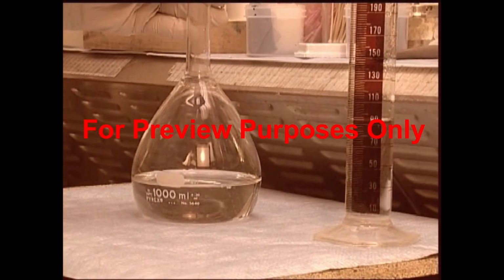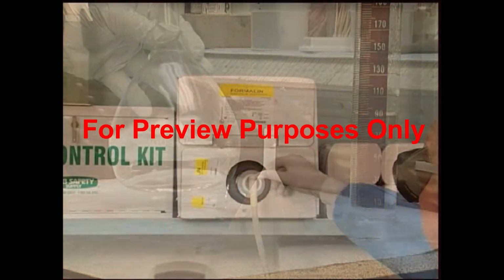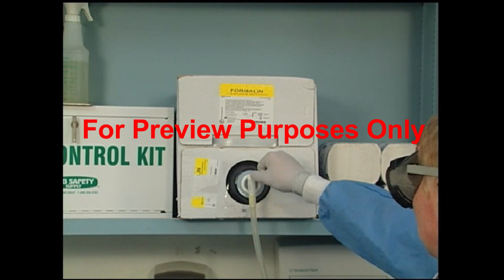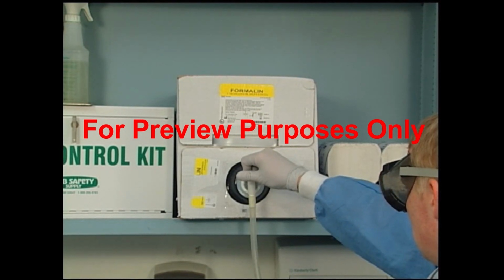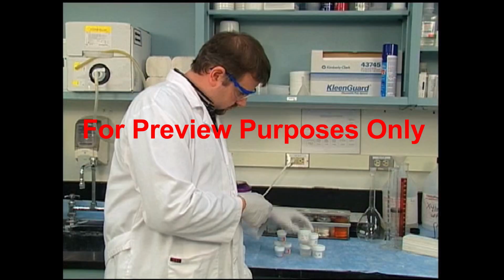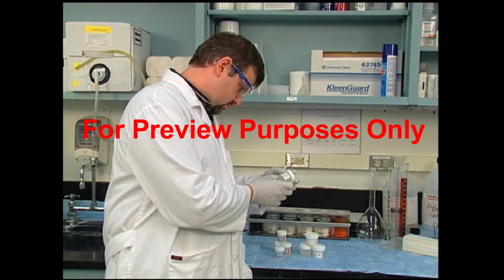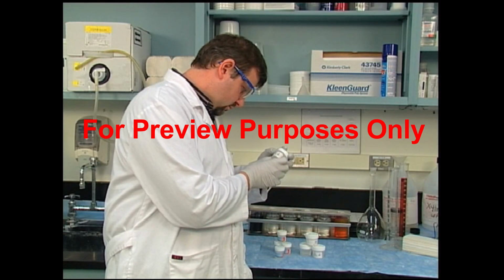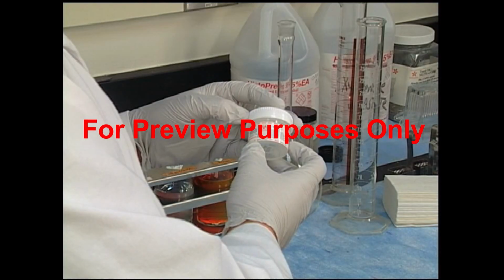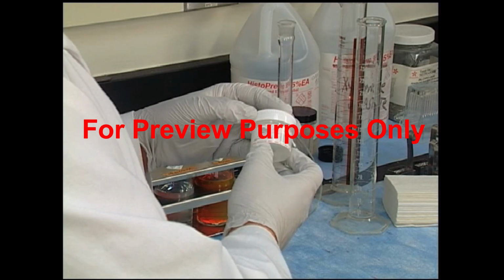If you are involved in this type of blending process, you should be especially careful. Nowadays, most formaldehyde comes already diluted in dispenser containers or unit packages, but you still need to pay attention to how to handle it. Even in a diluted form, formaldehyde can be hazardous. There's a reason that OSHA's hazard warning requirements begin at solutions containing only 1/10 of 1%.